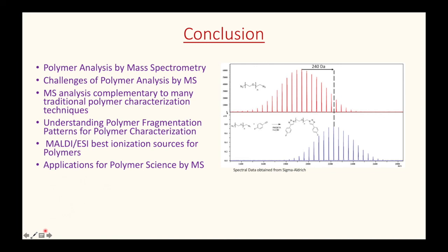If we can really understand the challenges, we can begin to solve some of these critical issues that relate to polymer science, and we can then start to improve our capabilities to analyze a broader range of polymers, and that's really the goal here. The polymer solvent matrix effects is going to be one area for continued research, and really how can we build on the information to improve the ability to ionize a broader range of polymers, and if we can, that will certainly be advantageous.